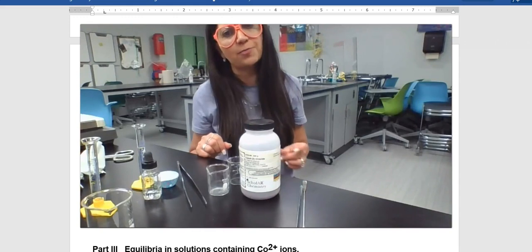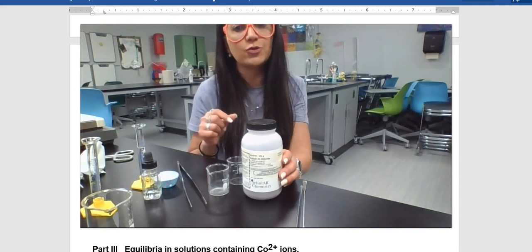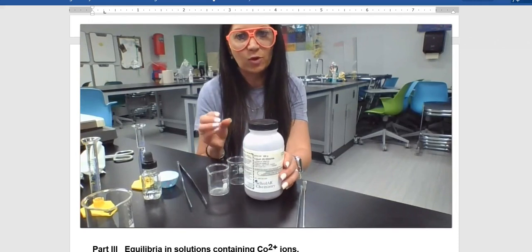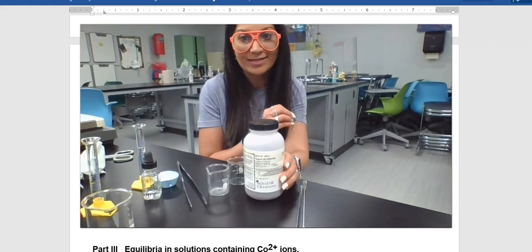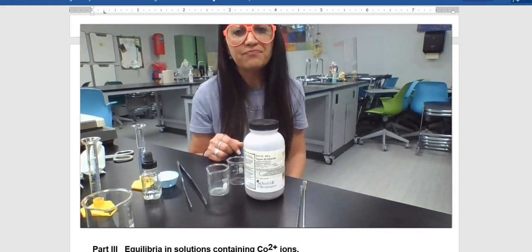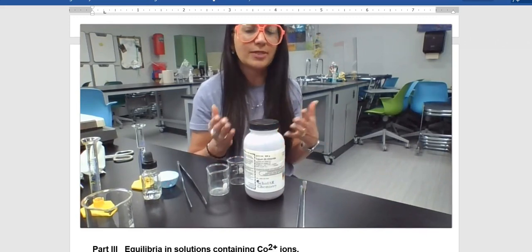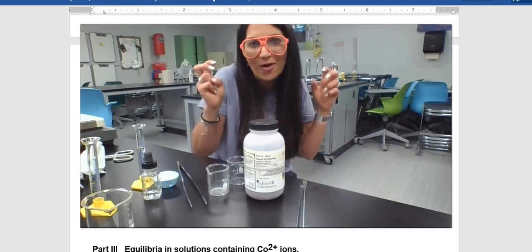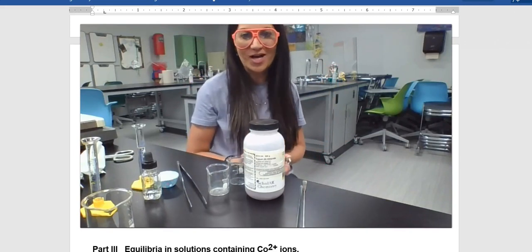If Cl- ions are present in high concentration, it's possible to convert that complex ion to a species containing Cl- ion. And so you can see it's no longer an ion anymore, but it's the cobalt with 4 water molecules attached with chloride ions as well inside of there, and that happens to be blue, okay? So we can see the reaction, and so it's got the pink, and then it's got the blue. So when it's just with the water, it's pink, but then with the chloride ions added in, it's actually blue, and it does form a cool cobalt blue. So if you've ever had to buy a paint color, cobalt blue is a cool color.